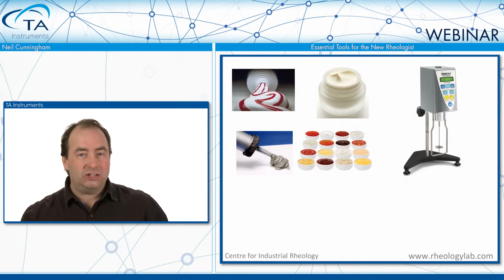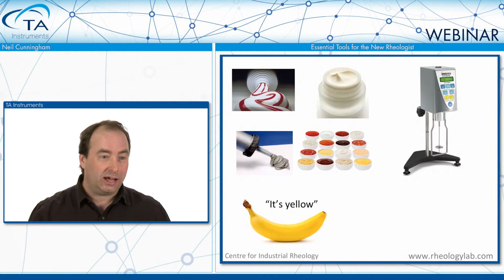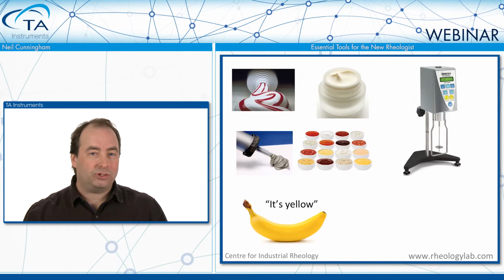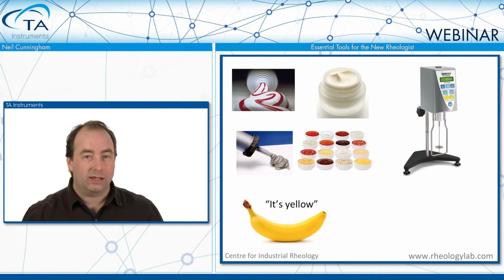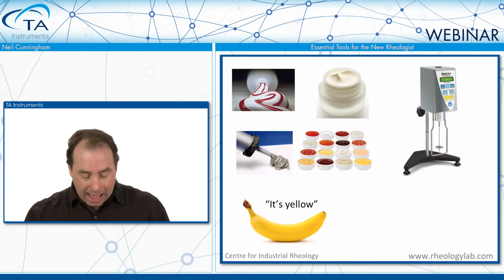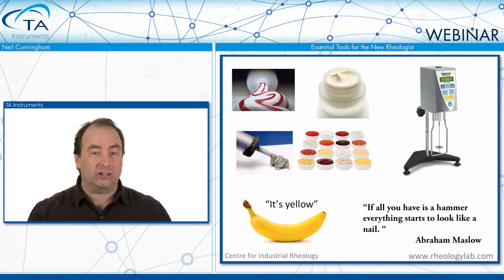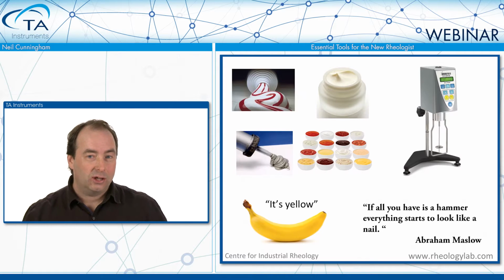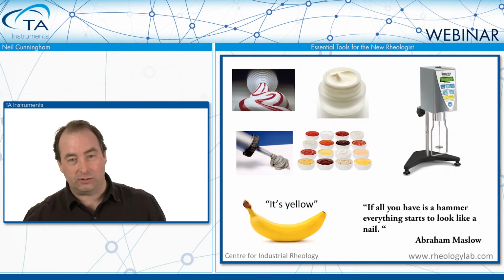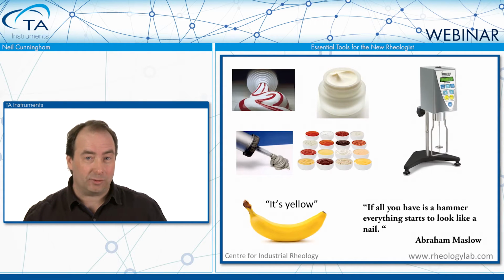Okay, but anybody getting into rheology will then realize that just as it's impossible to describe a banana by its color alone, it's impossible to capture the complex rheological attributes and properties of the sort of materials that we're dealing with in just a single number. And there's a more fundamental issue than that as well. There's a great quote from Abraham Maslow: if all you have is a hammer, everything starts to look like a nail. You can apply this to the use of viscometers, because if all you have is an instrument for measuring viscosity, a liquid-like characteristic, then you start to think about everything as a liquid. And as we'll see, that's actually far from the case.